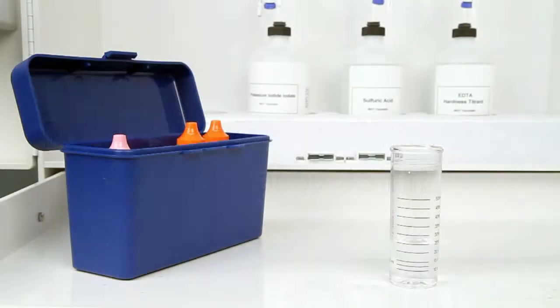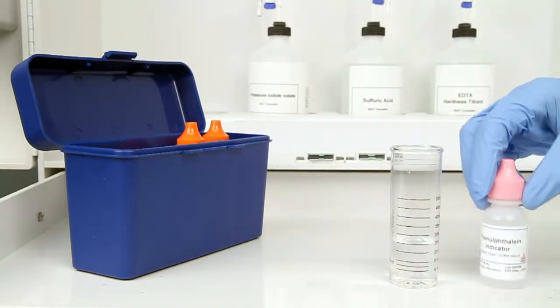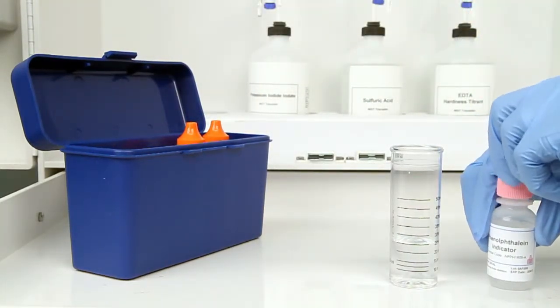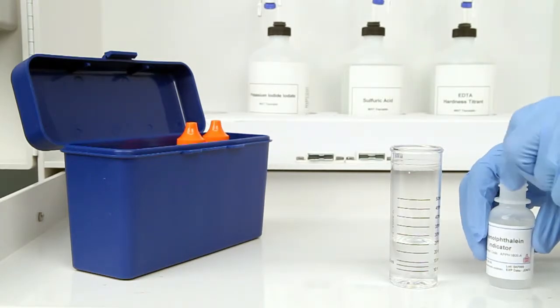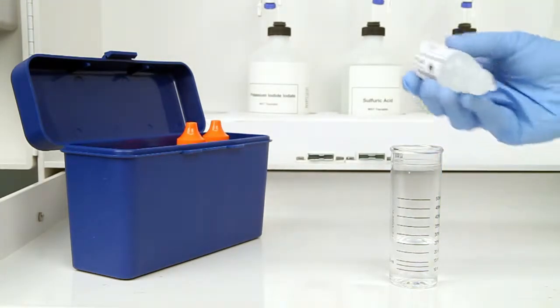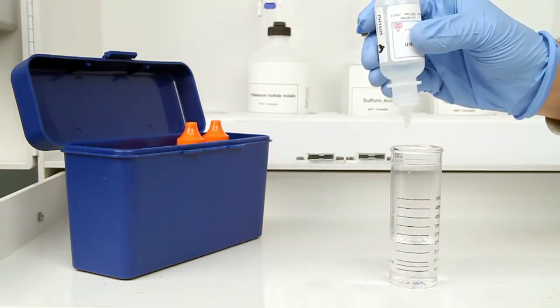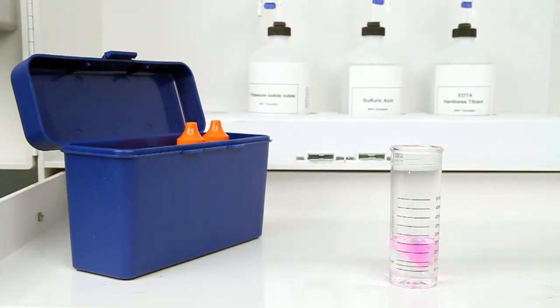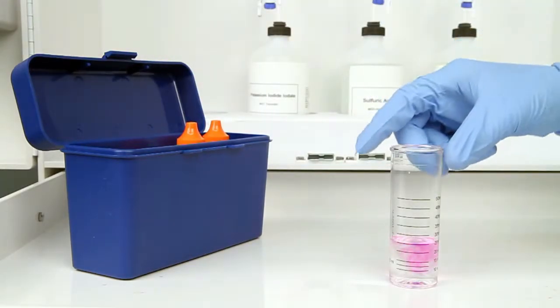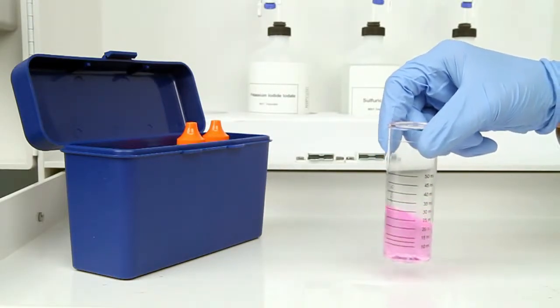The next step according to the endpoint ID procedure is to add one drop of phenolphthalein indicator. The bottle contains a dropper tip, so it's important to hold the bottle vertically to get a consistent drop size. After the addition of each reagent, it's important to swirl the vial to make sure the reagents are properly mixed.